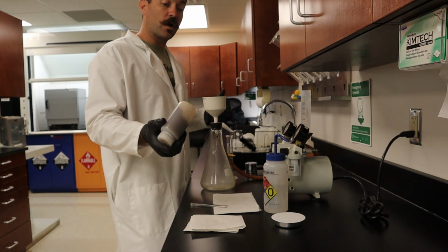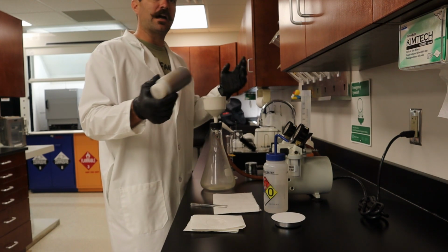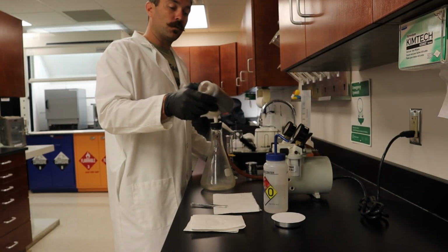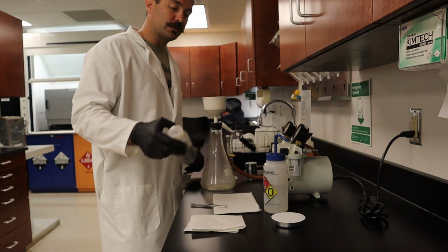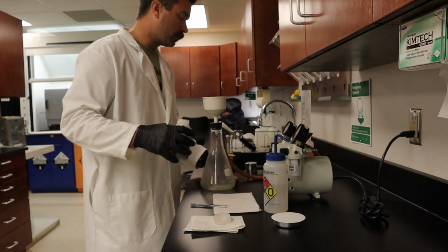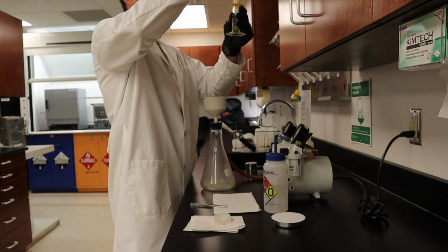going to be important. Whereas if you were doing a microscopic analysis, you wouldn't want to shear your floc and have stuff just messed up everywhere. But for this, it doesn't really matter. So we're going to mix it up pretty good. I mean, I'm not just violently shaking it. Give it a little stir. That's good enough there. Now we're going to pour up into our graduated cylinder that 50 mLs.